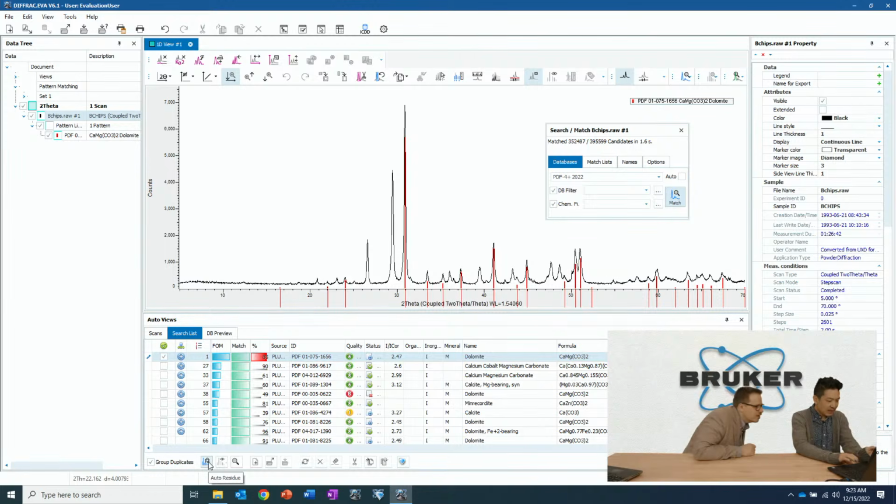I think the icon kind of looks like R2D2. It's a robot. Yeah, a generic robot that looks like a trash can. There is a trash can looking robot, but you'll see now my data here is in pink. Yeah, so they're kind of like a salmon color. So this has been a generic pink fish.